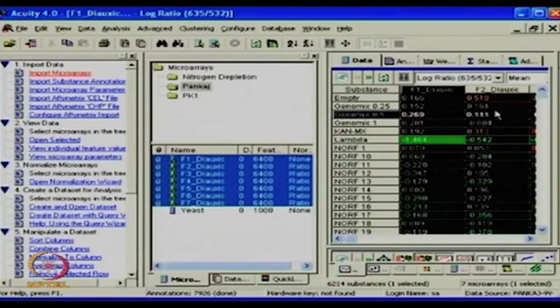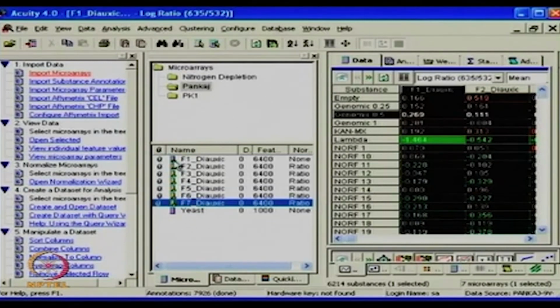Before going into this, let me explain an important factor here. What does each image mean? Sure. Actually, if you carefully look, it may not be very clear, but this is a little purplish in color and the other ones down are a little reddish in color. The purple one means that the data is not normalized. The red color means that the data is normalized, and the little green dot you are seeing tells me that I have a JPEG image which I can see down here. So it gives me connectivity of what is happening just by visualization.